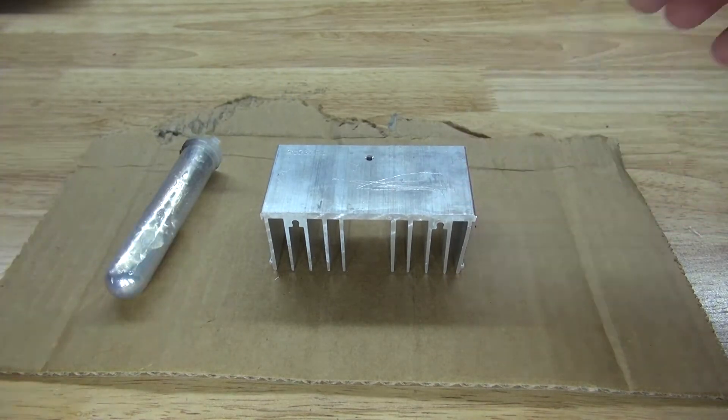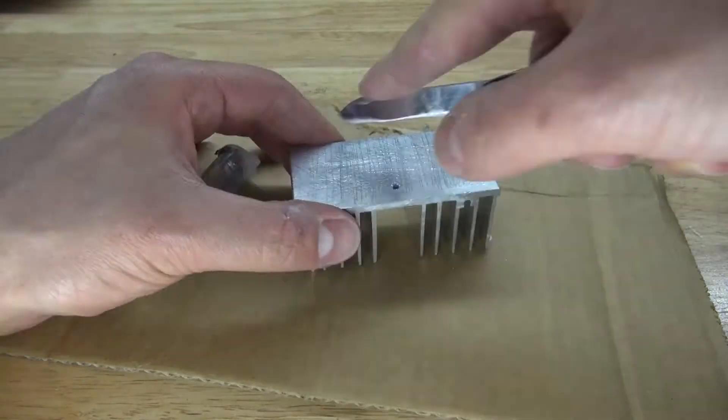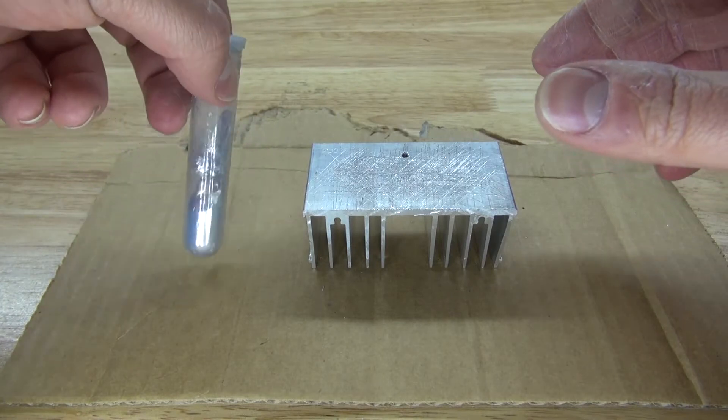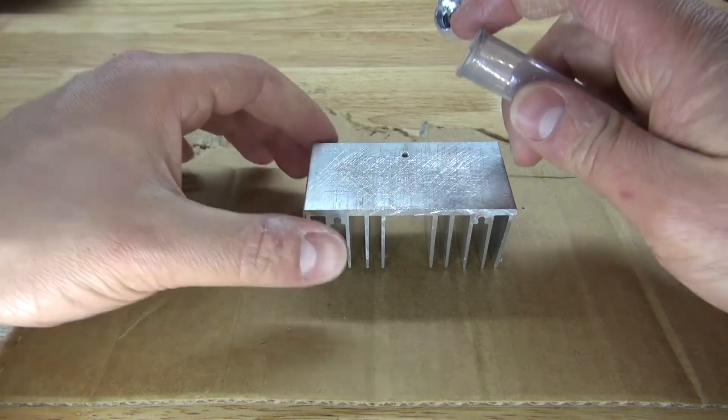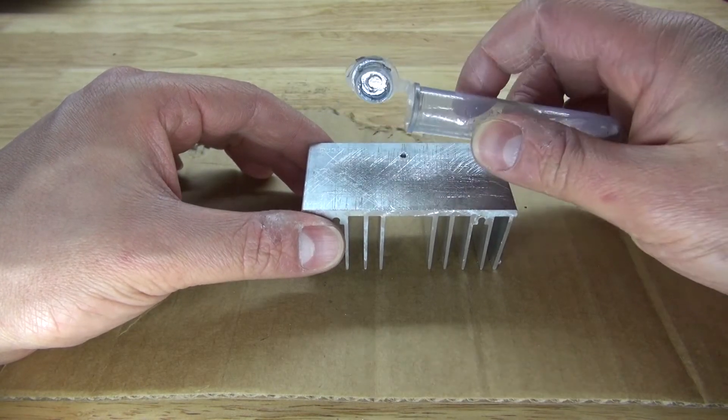So what I'm going to do is take this gallium and pour it on top of this aluminum. But before I do that, I need to remove the oxide layer by using my pocket knife and scratch off the surface, just like this. And now let's go ahead and pour it on top, just like this.